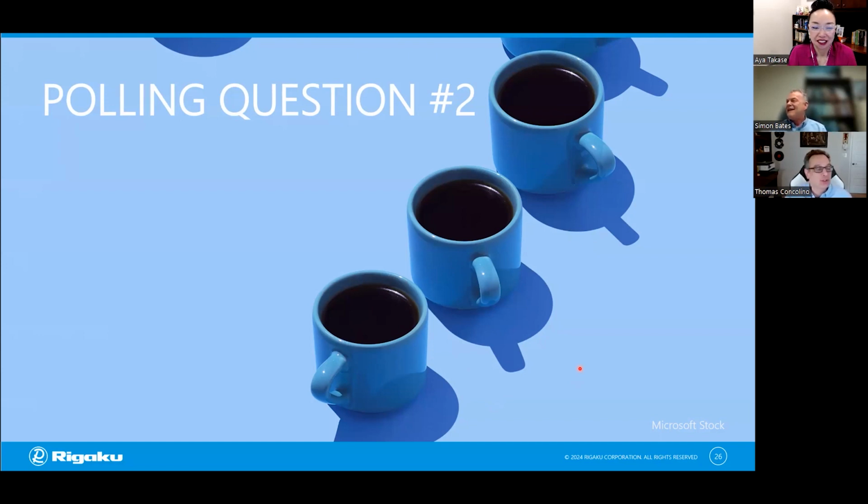All right. So Simon, we've had a couple of questions come in. Actually, we've had a bunch of questions come in, but I'll just address a couple of them here really quick. Okay. So at the beginning of this section, you were talking about line and point source, capillary pin mount. There are trade-offs on both of them, right? Intensity for a single crystal versus the powder, but the single crystal is more representative. Any advantage to either instrument, aside from Rigaku saying buy both because we sell both?